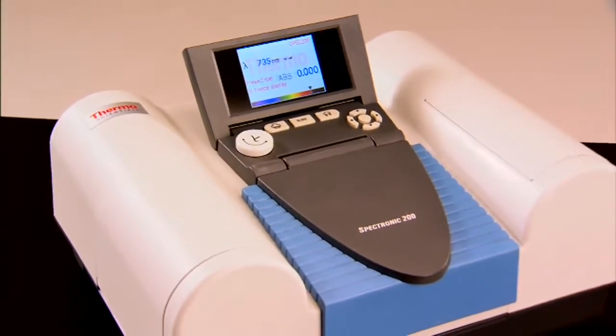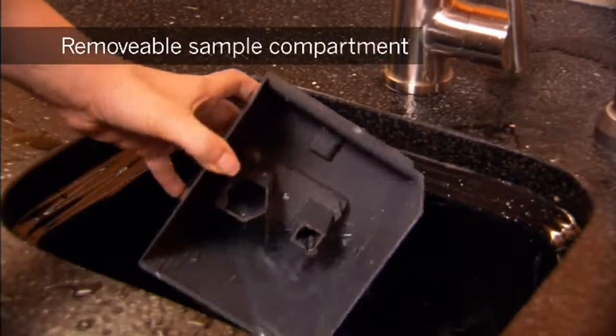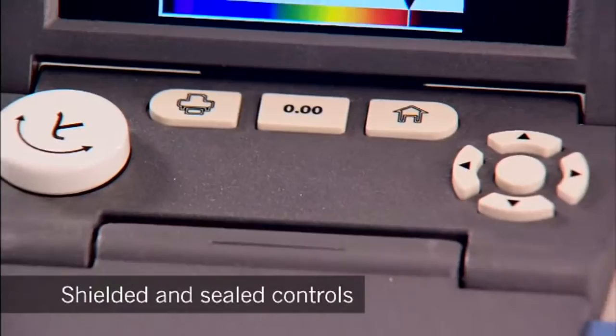Constructed of tough ABS plastic with sloping surfaces to shed spills, a unique removable and rinsable sample compartment, and shielded and sealed controls.